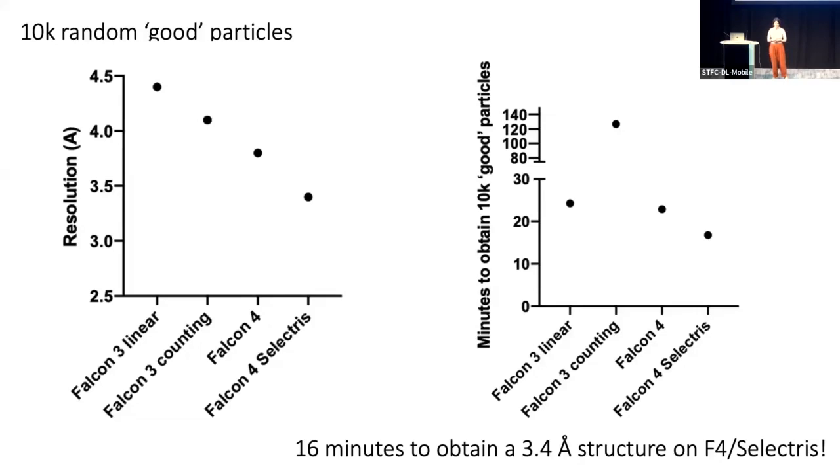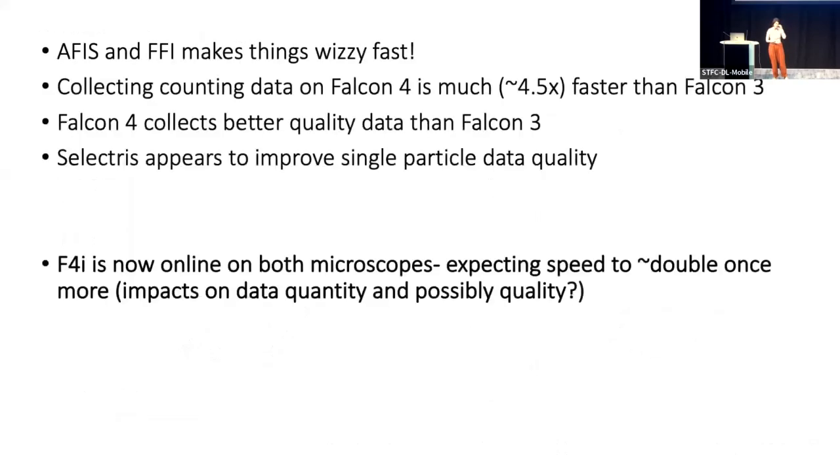This is a project where, if I look at the last several years, probably we would have looked at a grid, done a manual screen on that, and said, yep, particle distribution looks good, we'll go and collect a 48-hour data set. And when you suddenly realize that collecting 48-hour data sets on almost every biological specimen, not all, there would always be some exceptions, is probably too much data, and we probably don't need to be collecting that much.